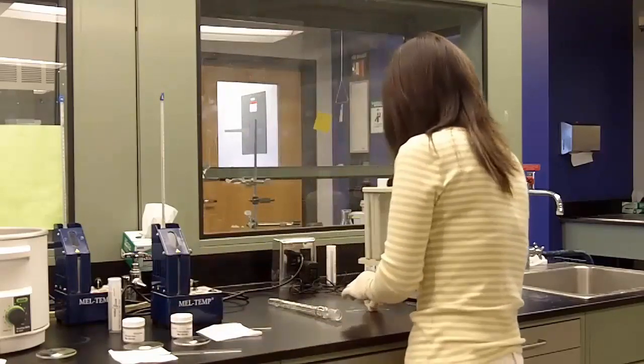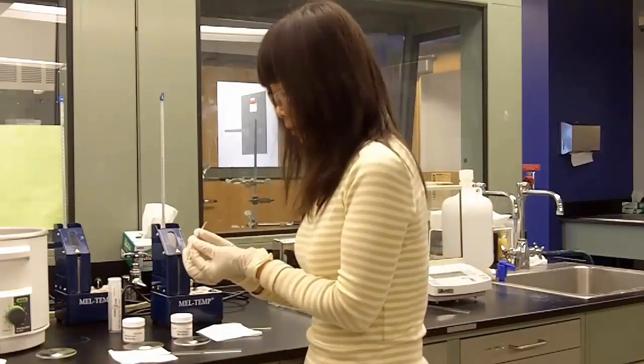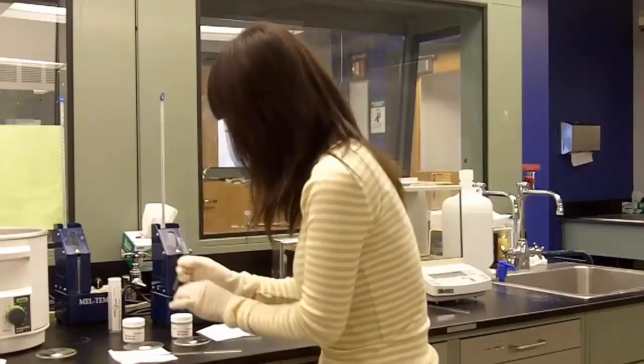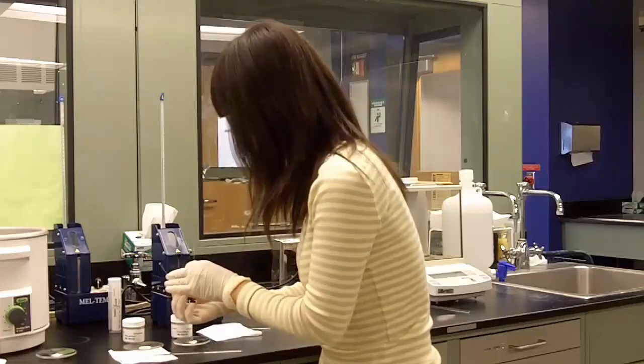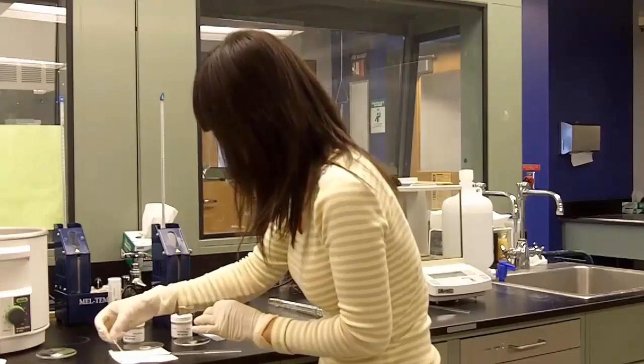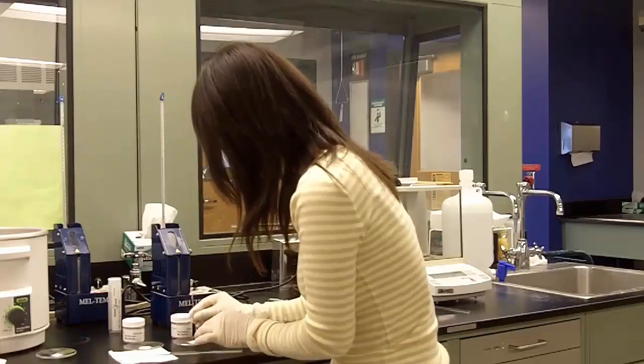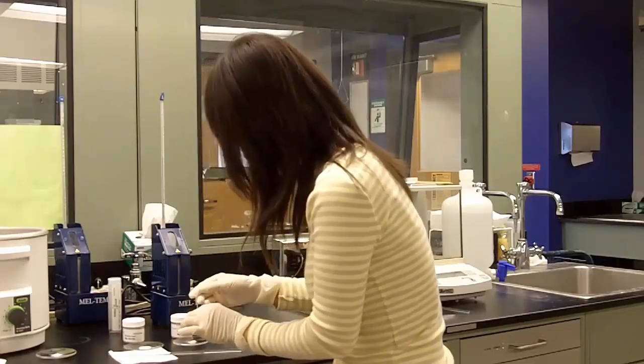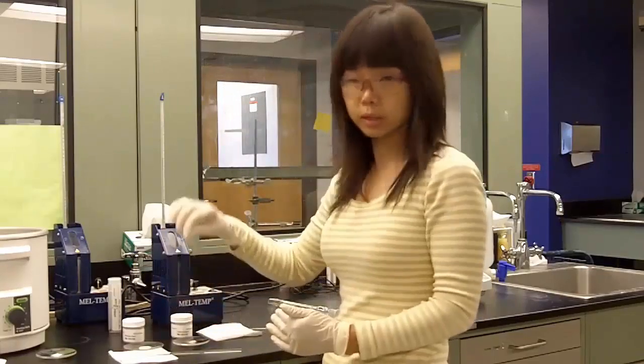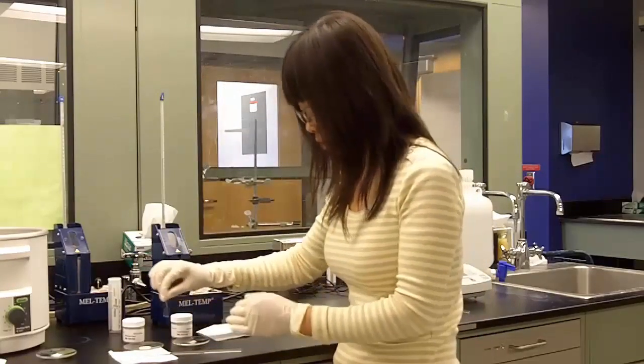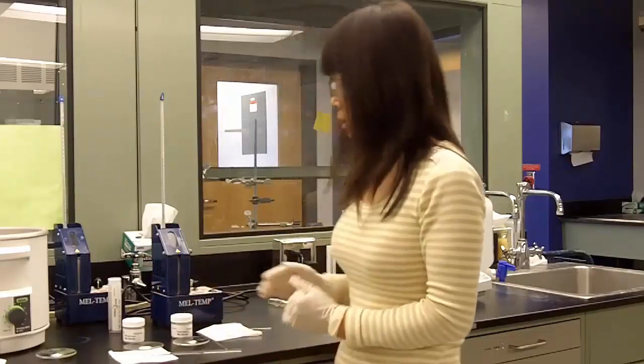And after mixing the samples, you take two capillary tubes and pack the sample into the capillary tube using the method we mentioned. Make sure you can identify which tube has which sample. This is very important. Put the right identity on the tube. So now we are ready to take a mixed melting point.